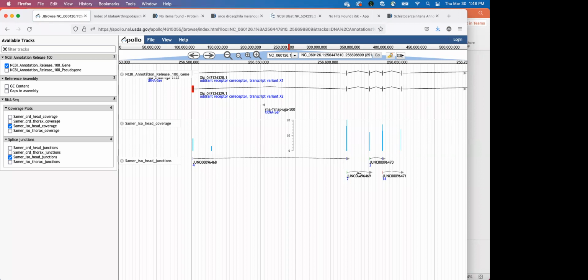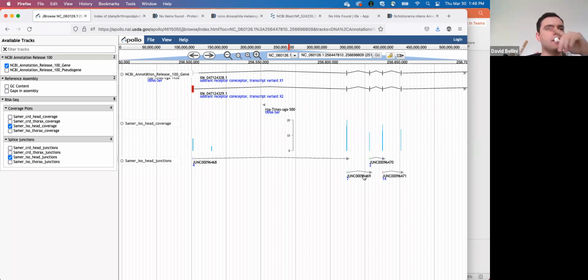Yeah. Sorry, so do those arrows mean that those particular alternative splicings go to the end of the gene? It's just not showing all the arrows because of the stacking? Is that what you were saying?